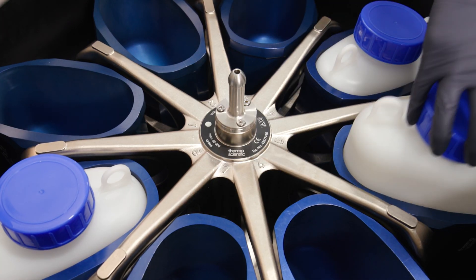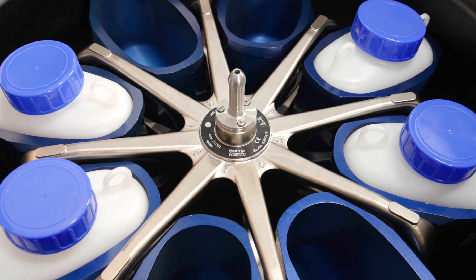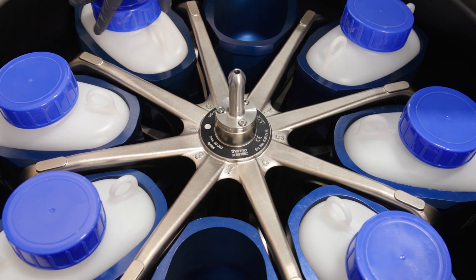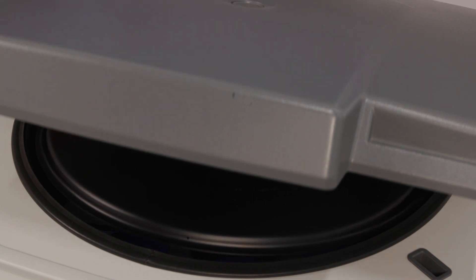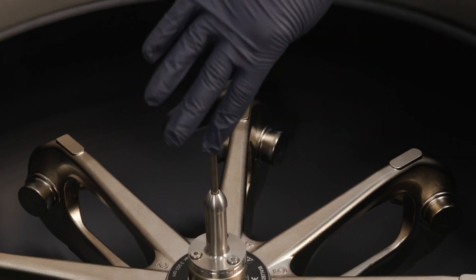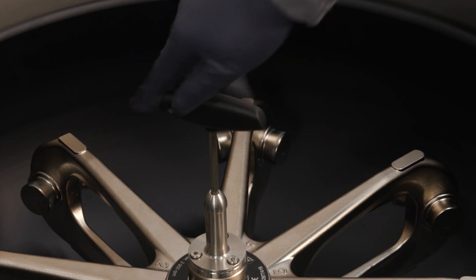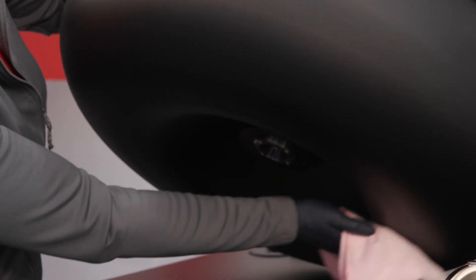Exceptions to this rule are commercially available glass or plastic centrifuge labware, provided it has been designed to fit the rotor or adapter cavities and is approved for the speed or relative centrifugal force value of the rotor. Make sure the rotor is locked properly into place before operating the centrifuge, and be sure all rotor parts are clean, dry, and have no nicks and scratches.